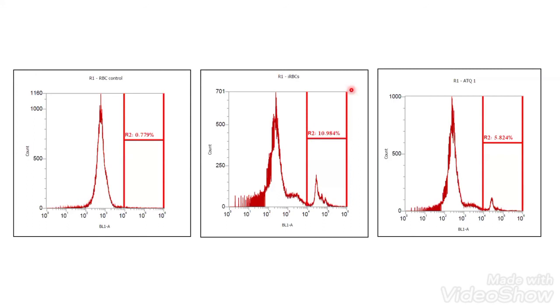So generally people use FITC to label different type of drug, and we have done these studies in good number actually. We have done for so many people who are coming with their drugs to check whether the permeability is good or not.